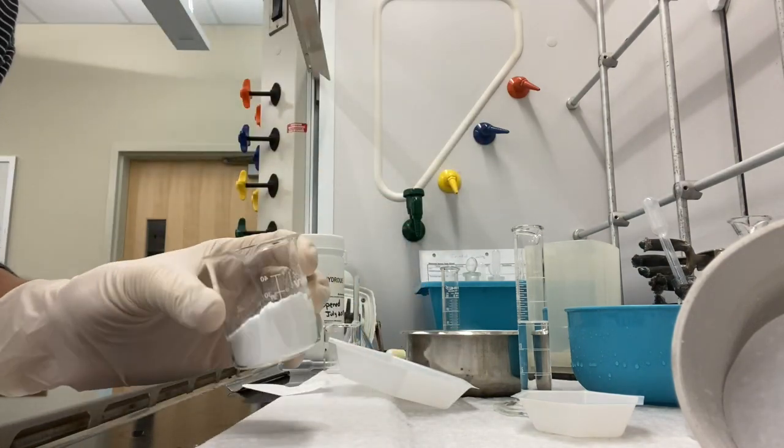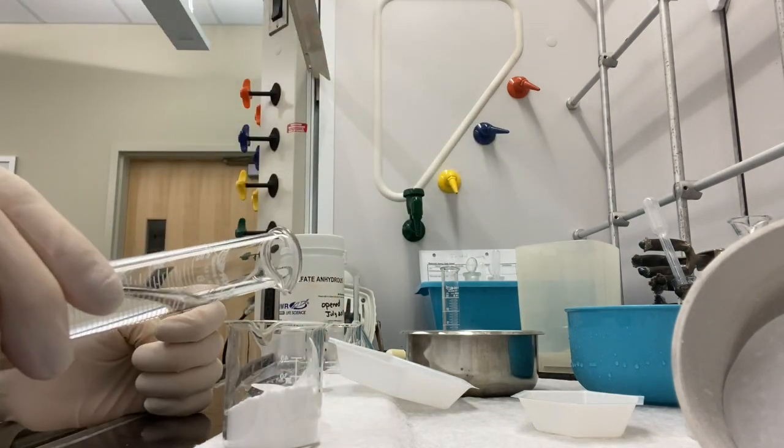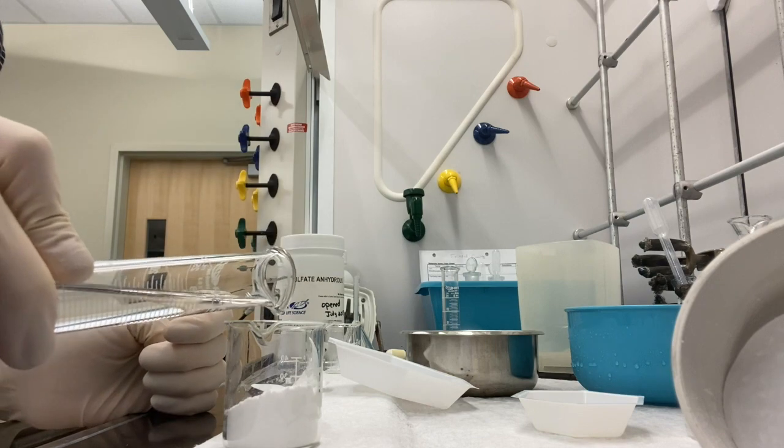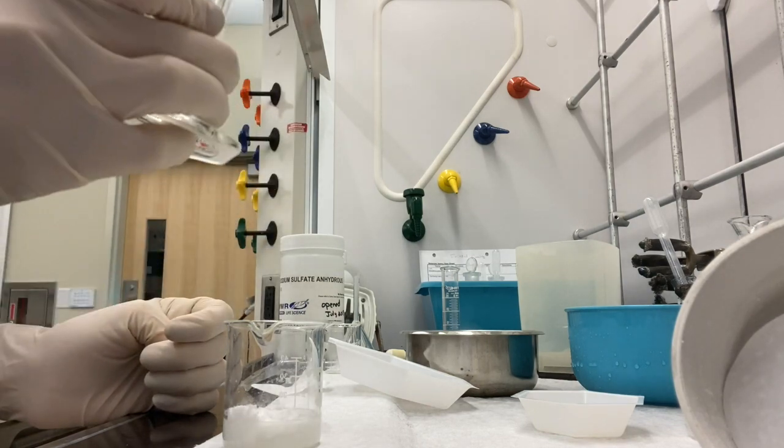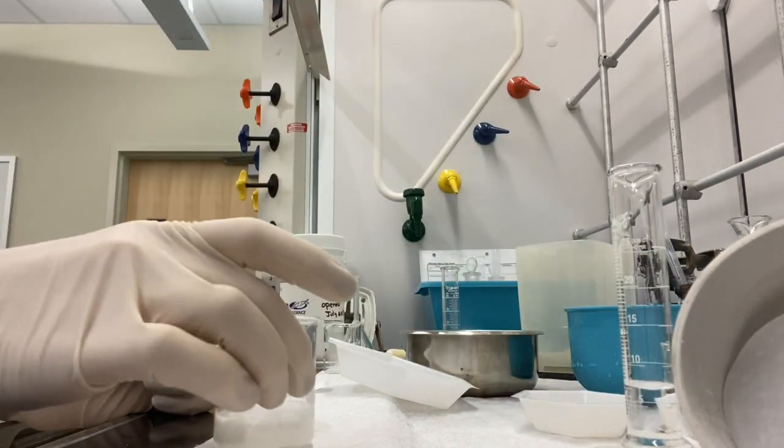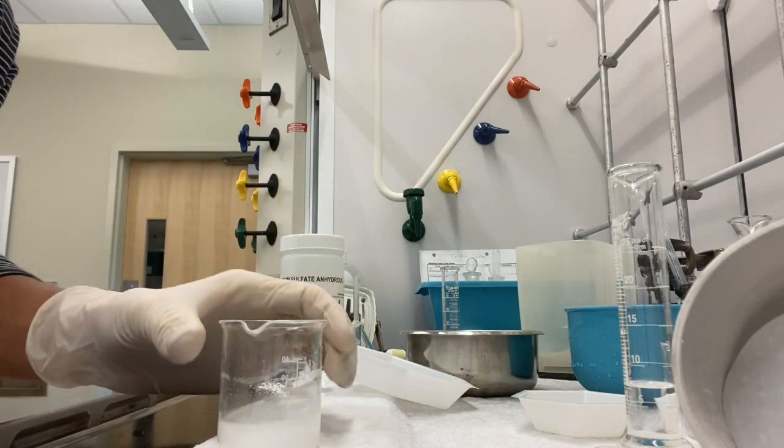So the next direction says to dissolve your solid in some dichloromethane. So that's what I have here in this graduated cylinder. So I'll take my dichloromethane and just pour it in here to dissolve my solid. And it dissolves pretty fast.